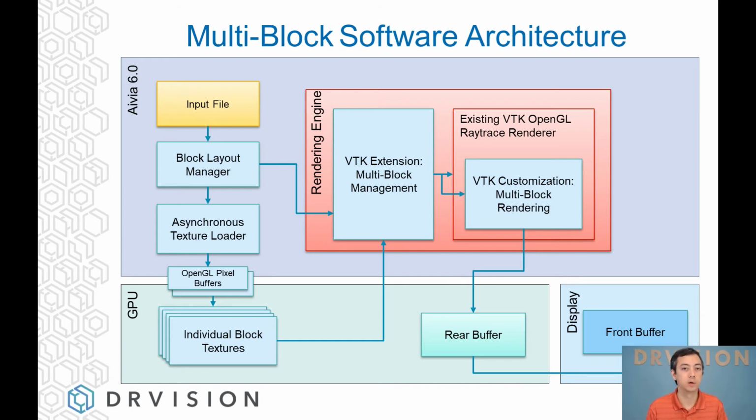multi-block software. And the other important thing is it'll cut it up, and it'll determine based upon where you're looking in Aivia while you're looking around. If you move the camera left to right or whatever, it'll decide that block should be high resolution because that's what they care about. And these over here, they're behind you or something, we don't really care, so we won't upsample those at all. And you can sort of get the idea of where we're going here, right?